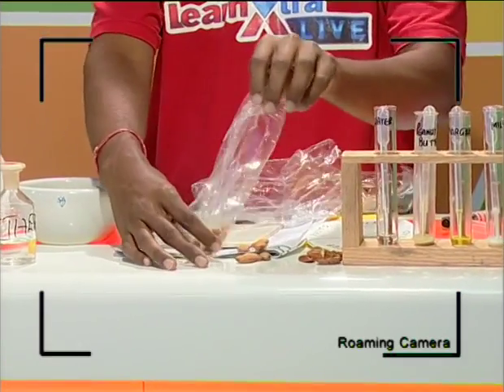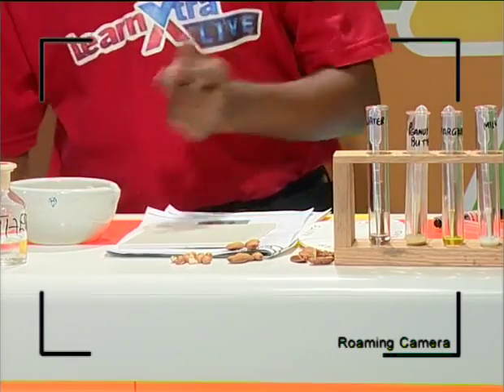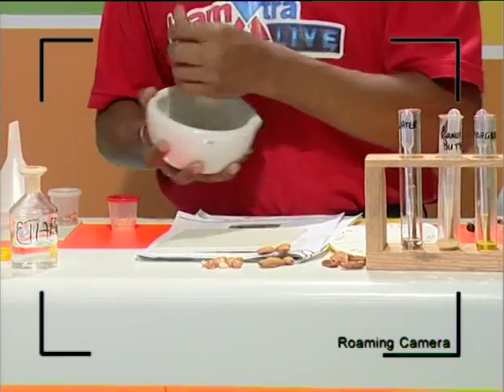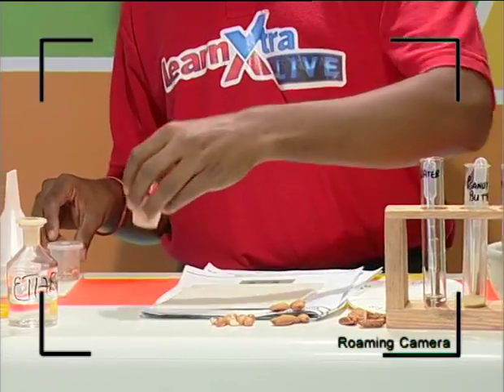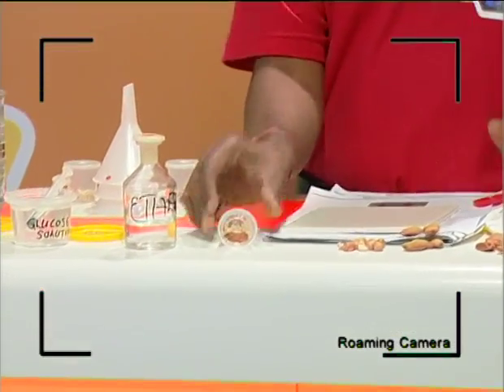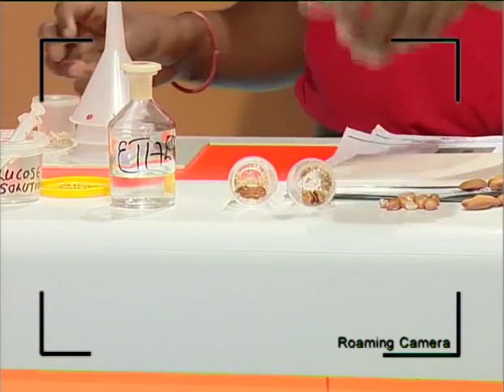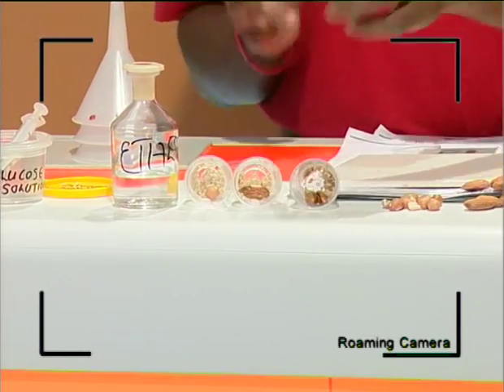What I've done, when I was at the lab, is crush these up and create a powder of them. I used a mortar and pestle, guys, and ground this up. It took me a little while, a little workout, and I've created little test tubes or containers filled with the extract that we need to test. So these contain pecan nuts, peanuts, and almonds.